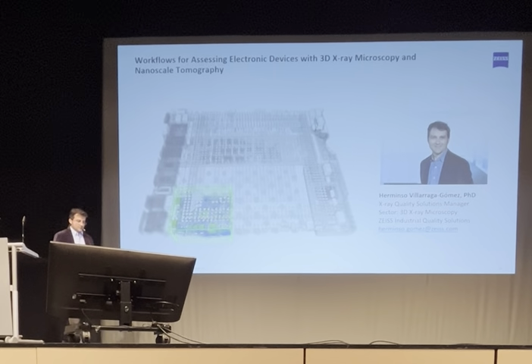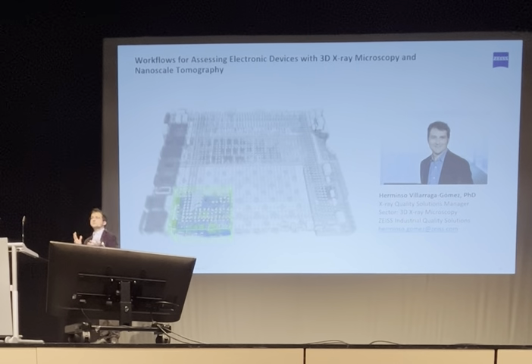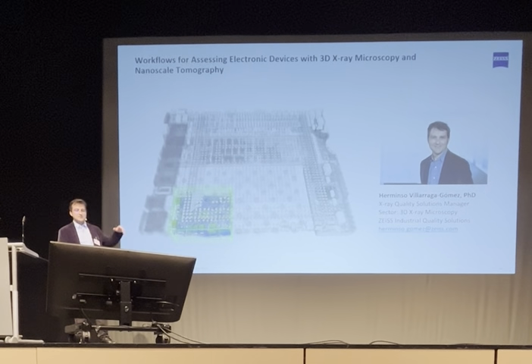Yeah, so the scan times, I already illustrated some of them. If you use the classical algorithms, which imply that you need more than 1,000 or 2,000 projections, you can easily spend a couple or 3 hours getting a small section. If you want to do the high resolution, you can even go to 10 hours or more. It's not surprising to see people sometimes reporting 20 hour scans, which is a lot, and manufacturers cannot afford that. The way to reduce that is with deep learning, which I illustrated here.